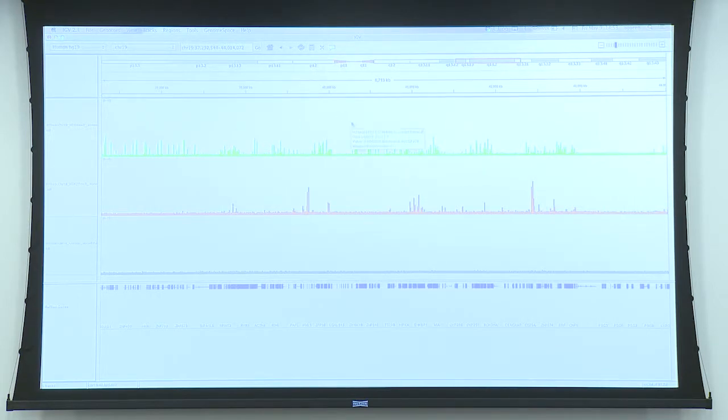Another point that someone asked me is how do you save figures? So if you just want to show someone a figure of how it looks, I use screenshots, which on my Macintosh I made a shortcut for, but I'm sure that you can figure it out, just Google screenshot, and that's very easy. In terms of the IGV itself, you have save image. Now in save image, let's just go to here, for instance, and do downloads.